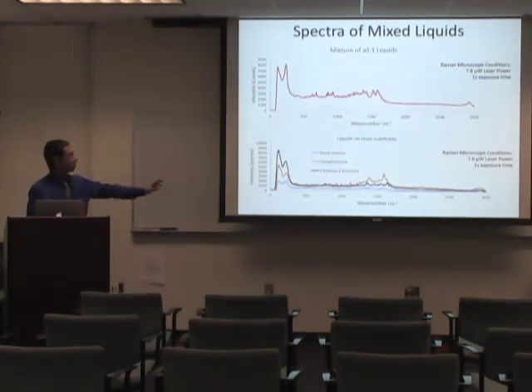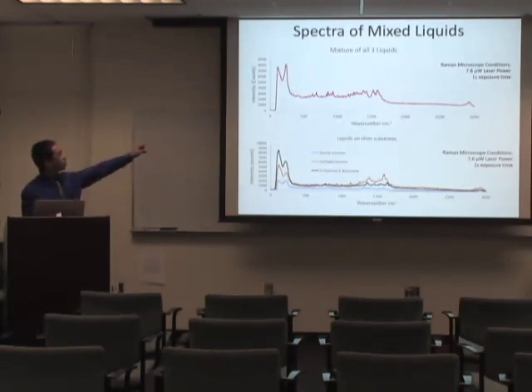And I brought this graph back up from the previous slide to see if we can find similar peaks between them. There are certain regions where we see similar peaks. However, we see that there are a lot more different peaks on top than there are on the bottom. We can quantify this data and observe how much of each ketone is in the data above using math analysis. I don't know how to use that part because I haven't been introduced to it. But essentially, we can see how much of each ketone is present there. And also the different peaks can represent mixtures of two different ketones. So maybe not all three of them are together, maybe it's just two of them in one peak, and so on.